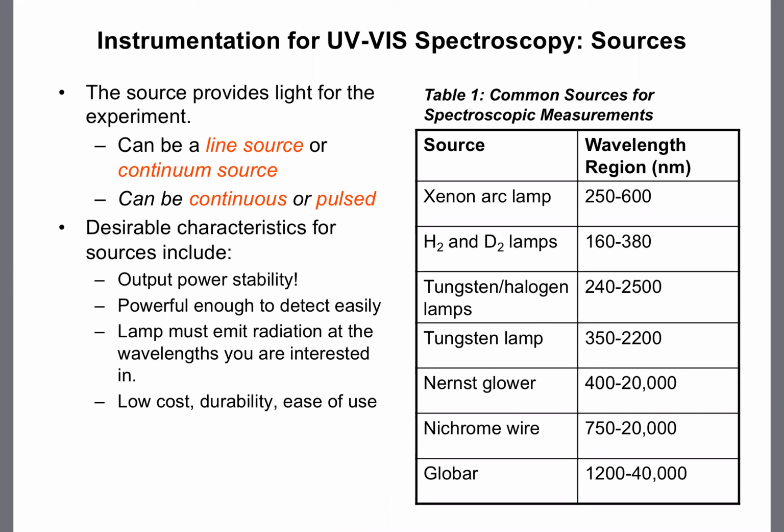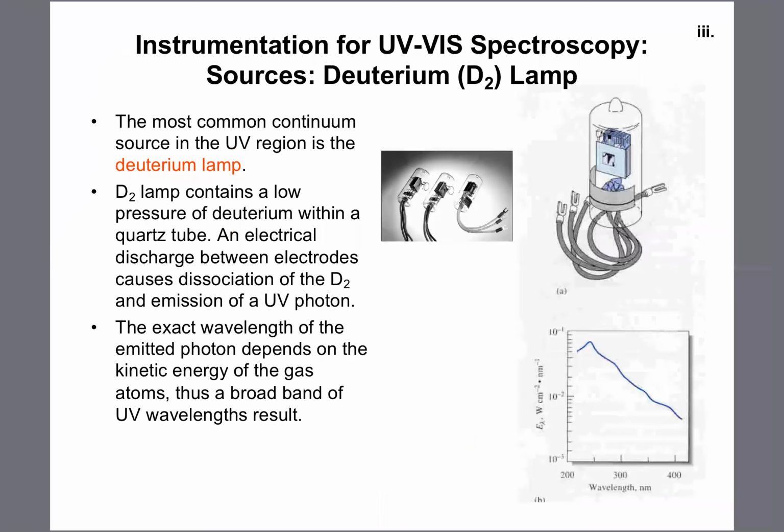Hopefully it doesn't burn, right? So these are different spectroscopic sources. Now let's review a few that are specifically used for ultraviolet visible molecular absorption spectroscopy.